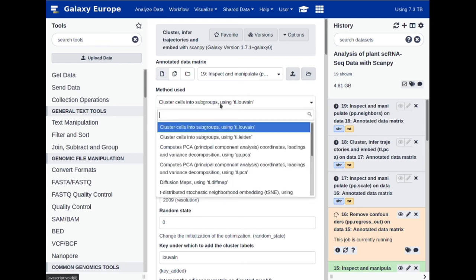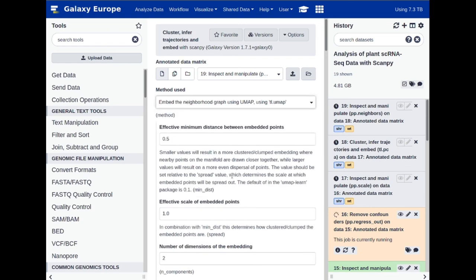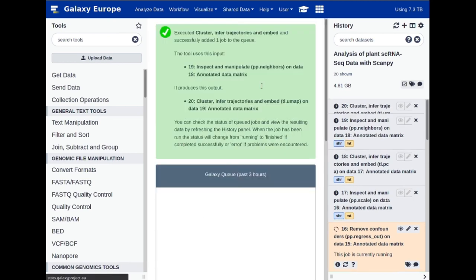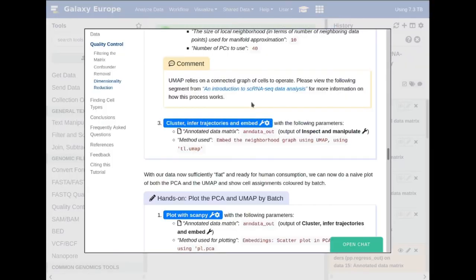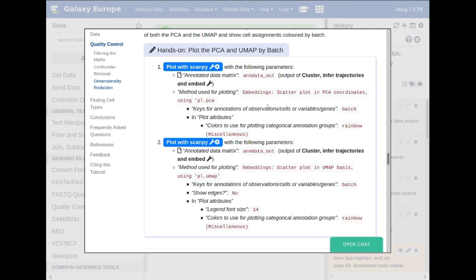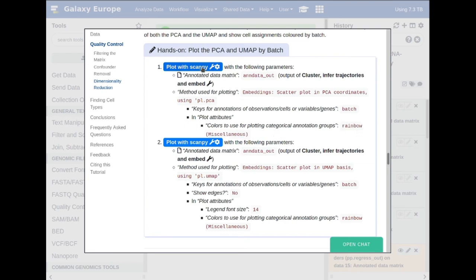Then we will generate a UMAP embedding. Go to 'Generate UMAP' and keep all the defaults, especially number of components set to 2, then execute. These steps are for generating the coordinates for these embeddings, but to actually see them we have to plot them. Let us plot with scampi — first the PCA, grouped by batch, using a rainbow color scheme in the plot attributes, because sometimes the default colors don't work so well.